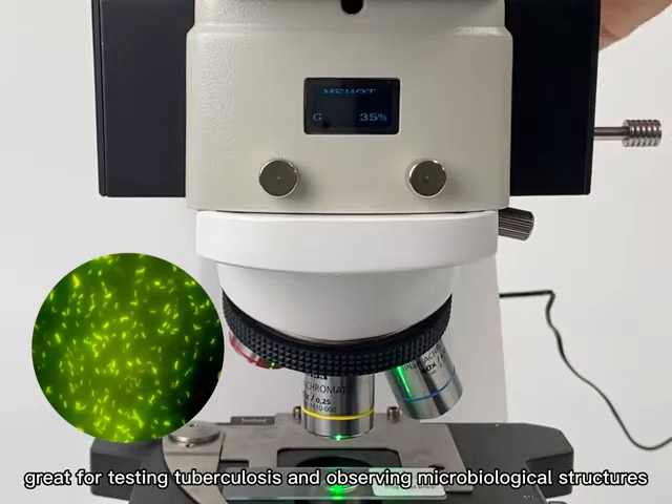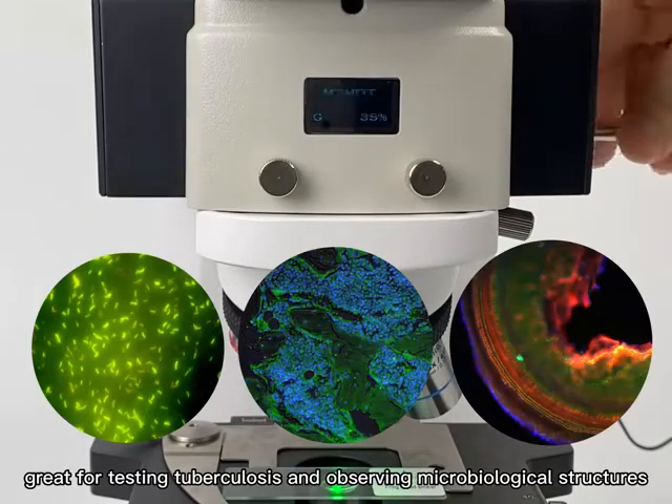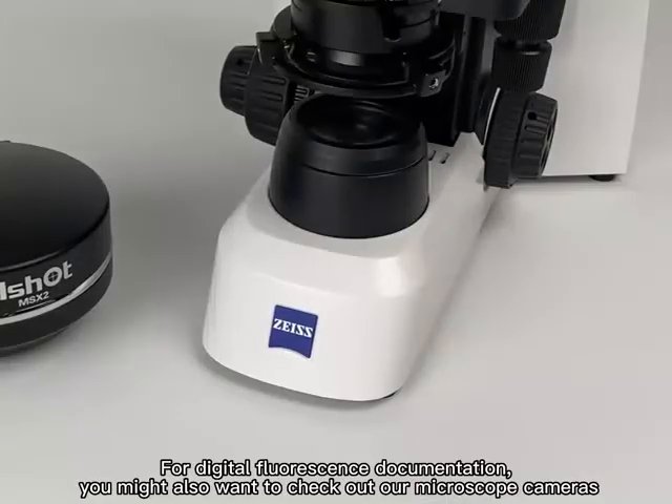It's great for testing tuberculosis and observing microbiological structures. For digital fluorescence documentation, you may also want to check out our microscope cameras.